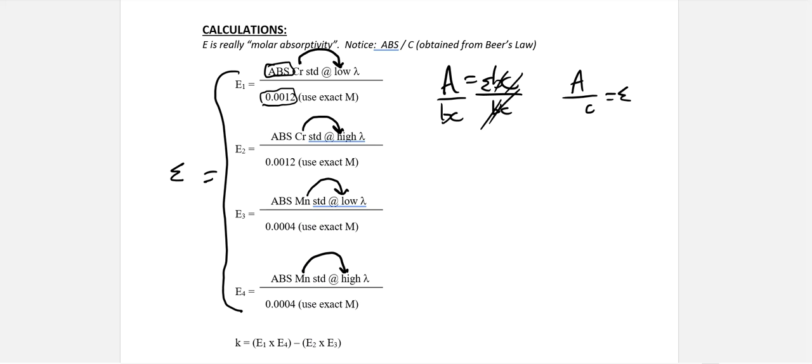So in the old way of doing these calculations in the lab, instead of using the matrix, they made you break this calculation down step by step by step by step. And in this first part, it was all molar absorptivity based. That's what these numbers are. That's what they always have been, and that's what they are here.